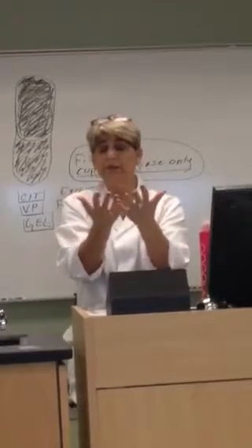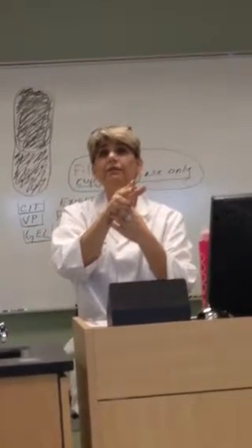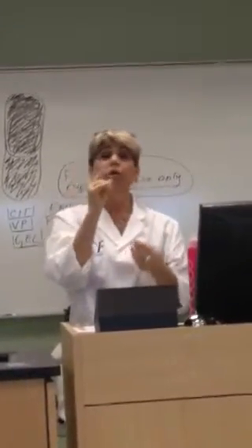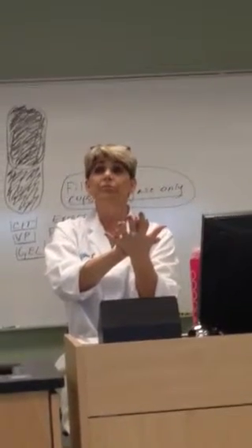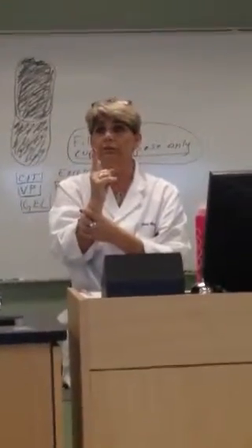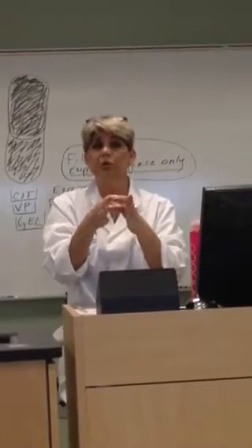No. Not much, right? What are CFUs? Colony forming units. Why are they called colony forming units? They're going to form a colony. But what are they right now, as soon as I put them on the plate and spread them apart? They're individual cells. Theoretically, one CFU is one cell. That one cell, put it in an incubator, it's going to divide and divide and divide until it grows into a visible colony.